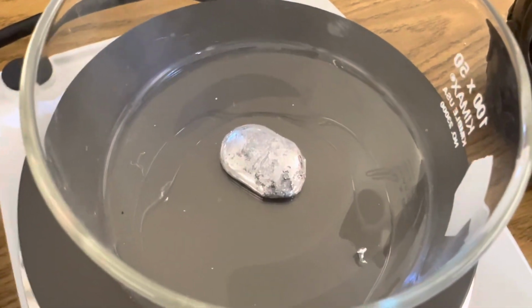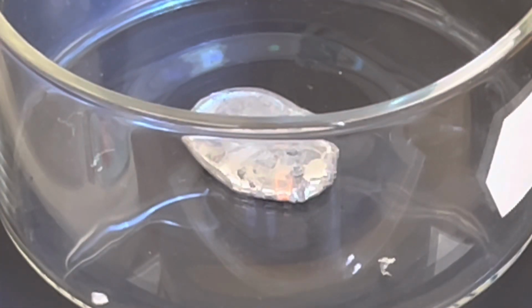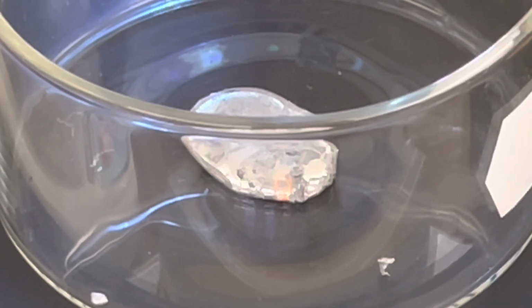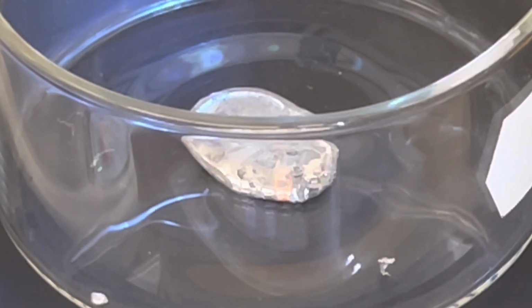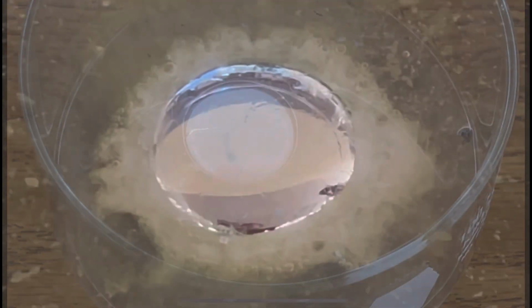Remember, gallium is mostly used in electronic circuitry. The next step is to add a small amount of sulfuric acid to coat the gallium. At this point, the sulfuric acid and the gallium have combined its reactants to create the product gallium sulfate and, of course, hydrogen gas. And that gallium sulfate on the surface of the gallium actually causes it to beat up and to contract. So the oscillating beating heart of gallium happens every time I add a drop of potassium dichromate.